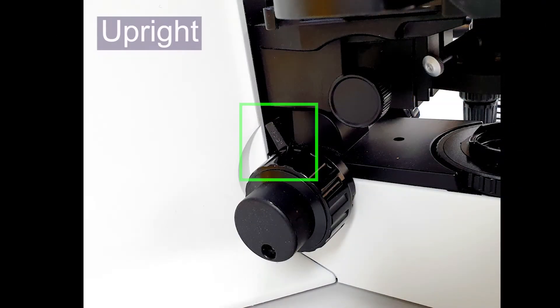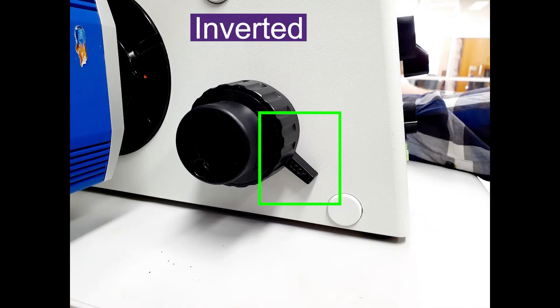The position lock can be very helpful to limit the objective from touching the sample during normal microscopy operation.